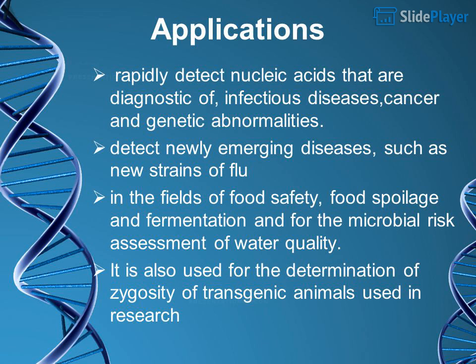Applications. Rapidly detect nucleic acids that are diagnostic of infectious diseases, cancer and genetic abnormalities. Detect newly emerging diseases, such as new strains of flu. In the fields of food safety, food spoilage and fermentation, and for the microbial risk assessment of water quality. It is also used for the determination of zygosity of transgenic animals used in research.